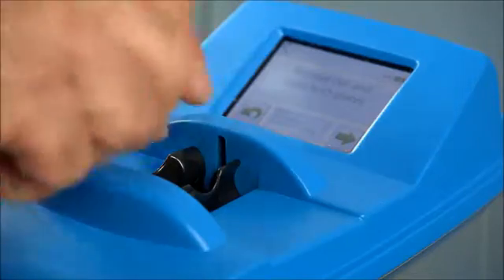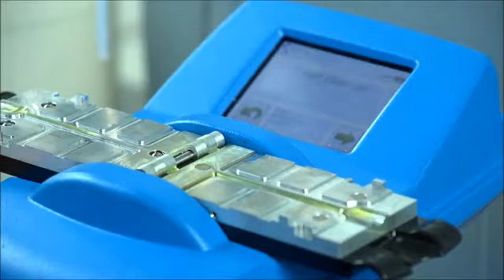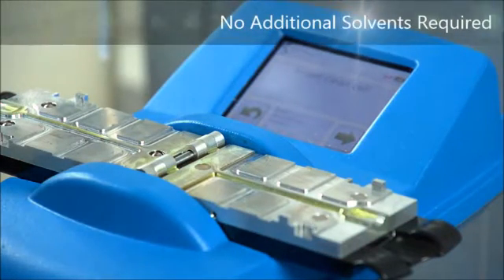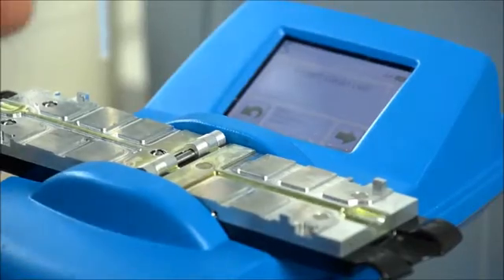After each sample, you want to clean the plates in order to prepare for the next sample. No solvents are required to clean the viscometer — a simple non-abrasive cleaning pad is all that's required.